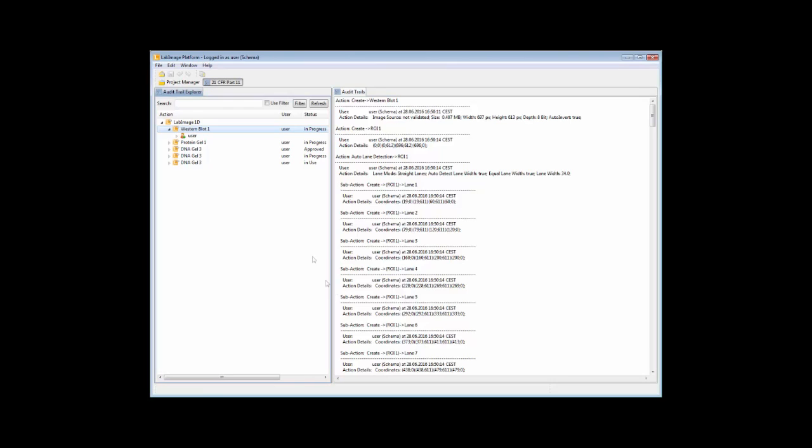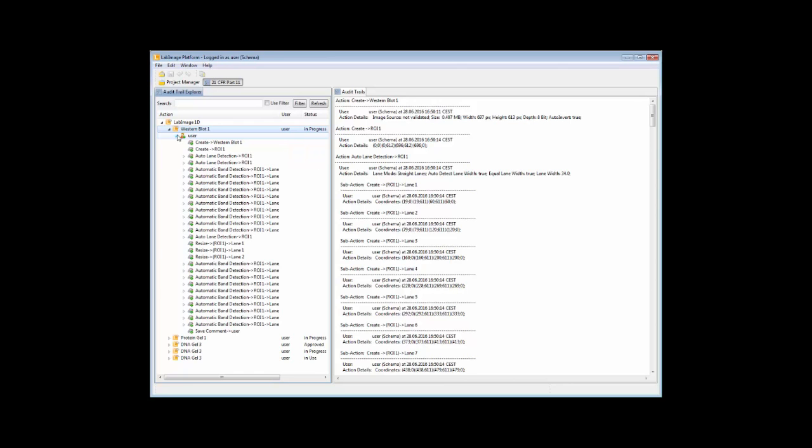The audit trail tab displays a list of projects and the according users. Each action can be detailed within this tree and you will see a total list of actions on the right side.